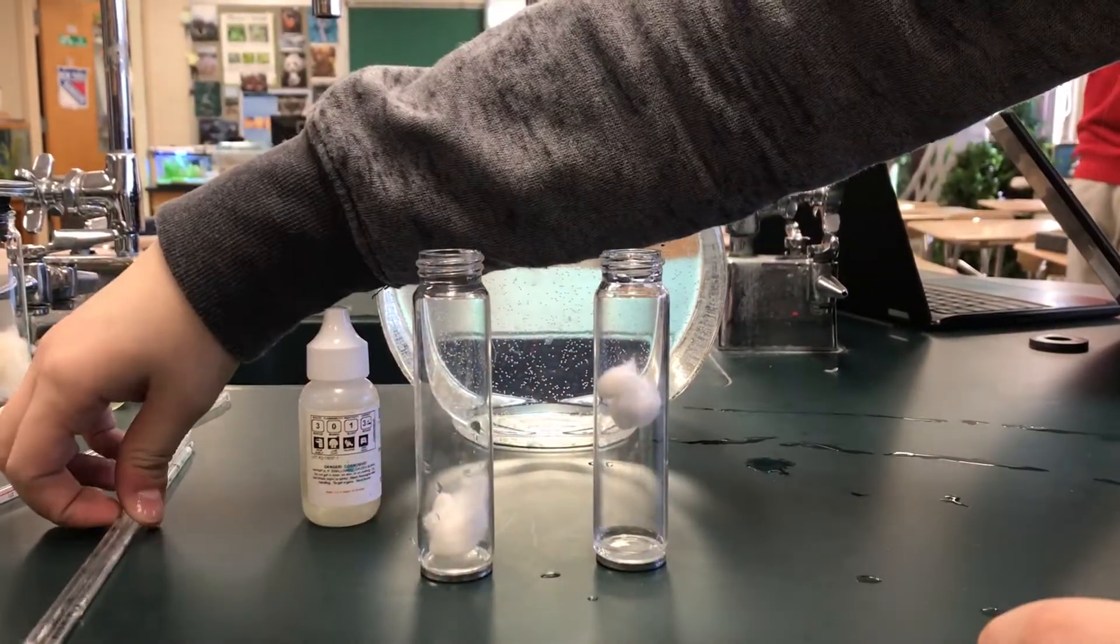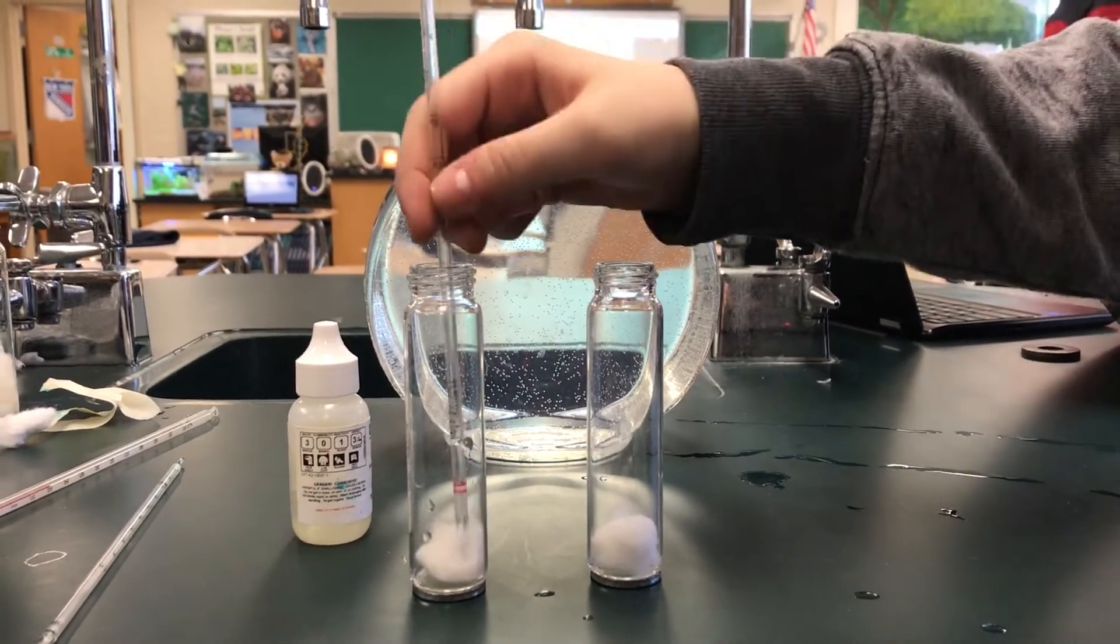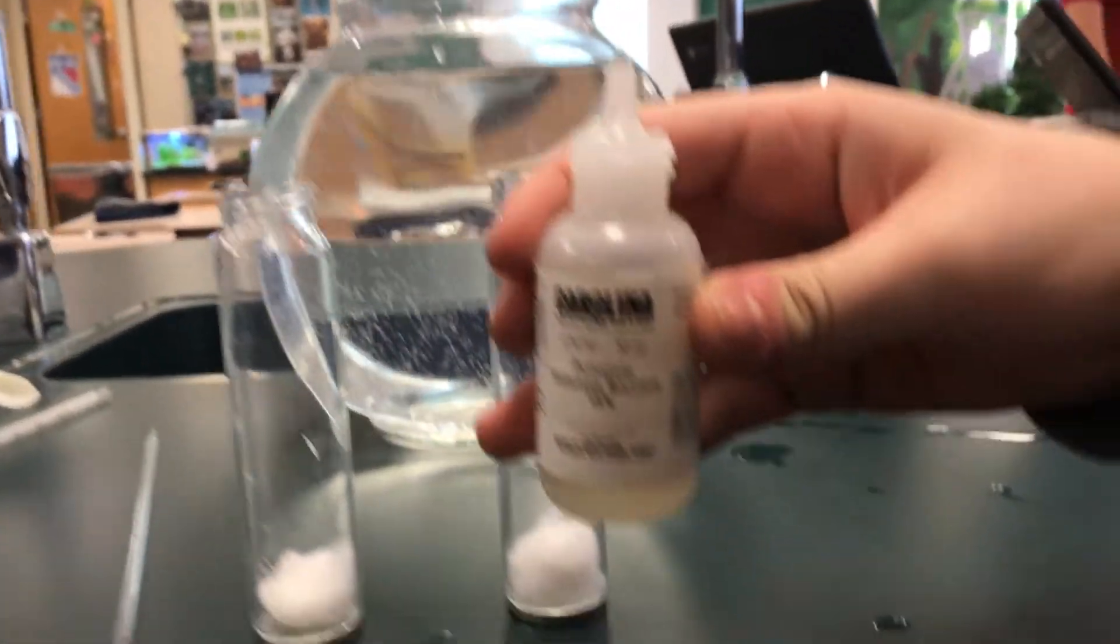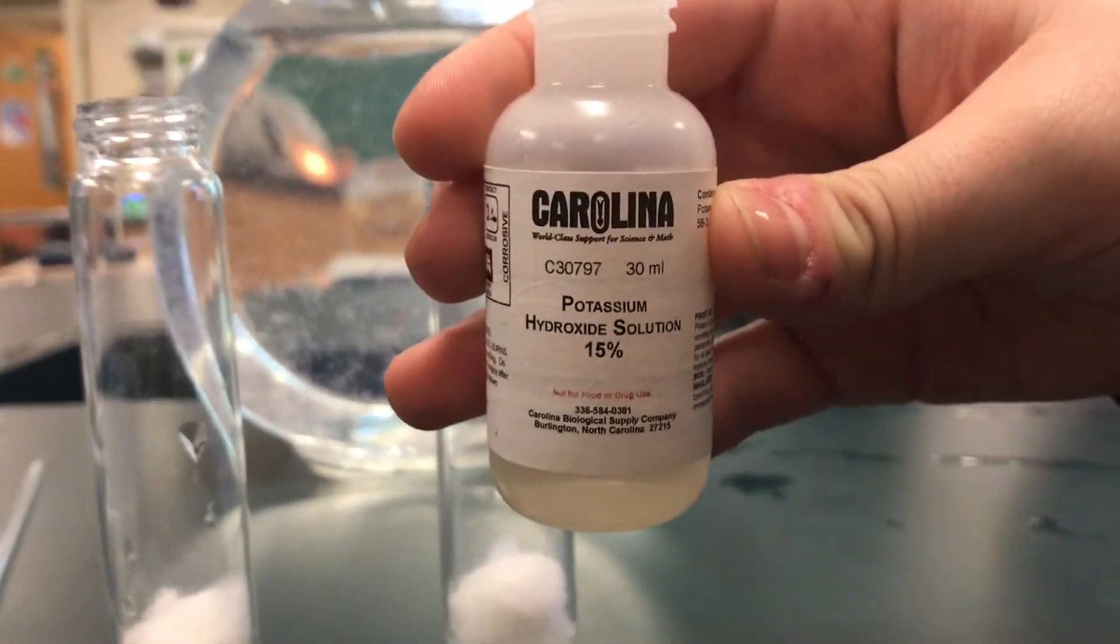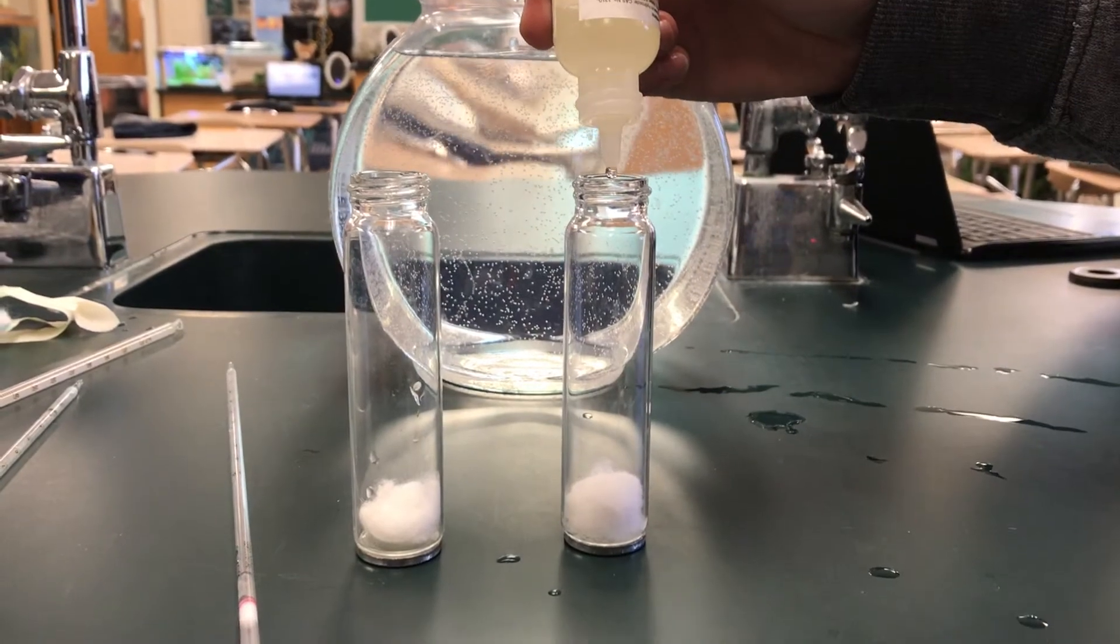Starting off this experiment, place the absorbent cotton balls into the bottom of the chambers. Now, taking the potassium hydroxide, you'll want to put equal amounts in each chamber, and that should be around 10 to 15 drops in each.